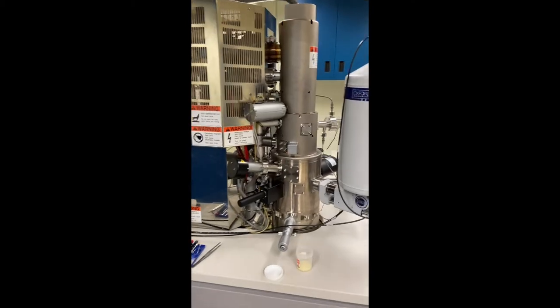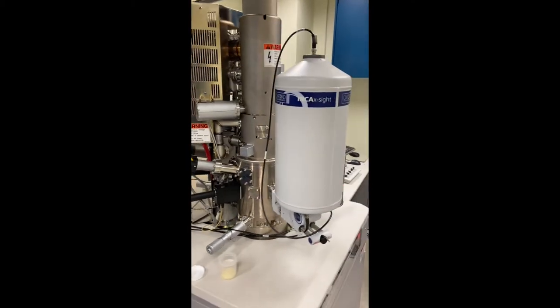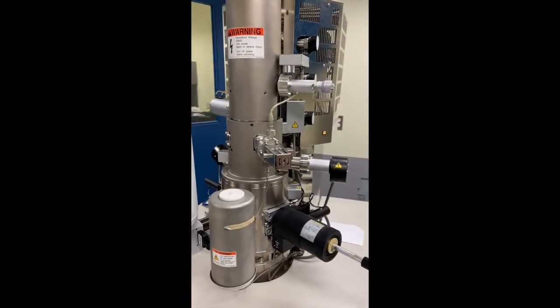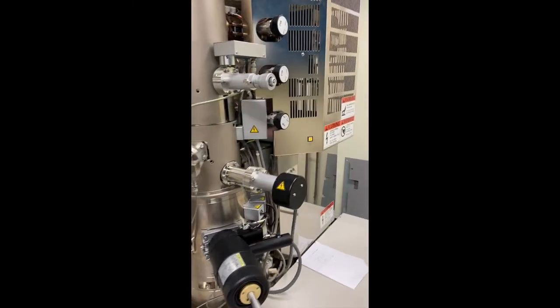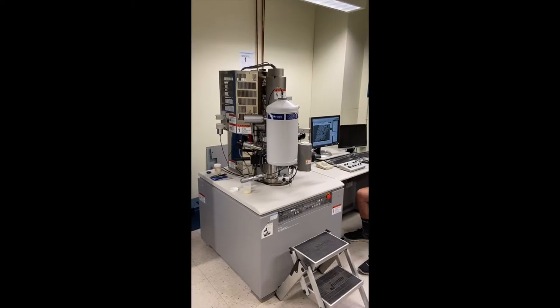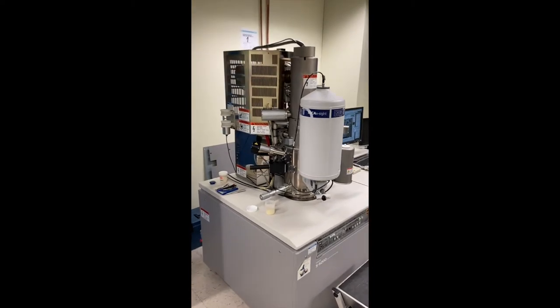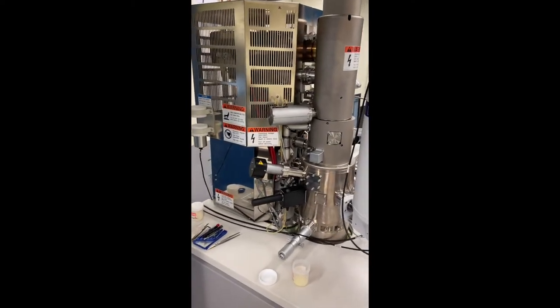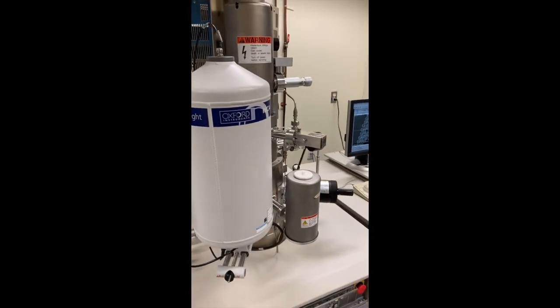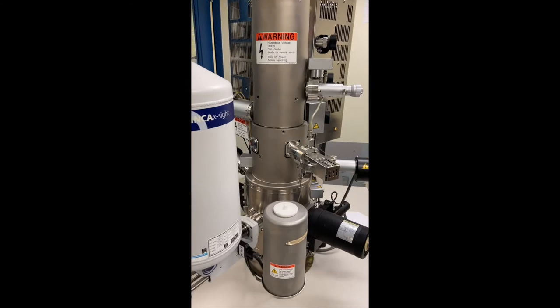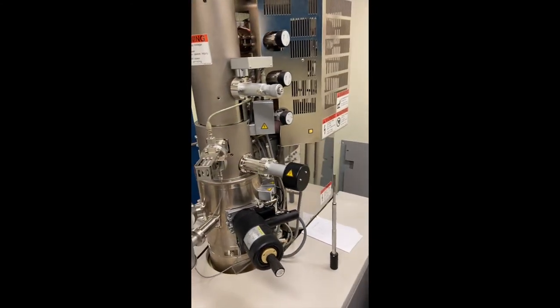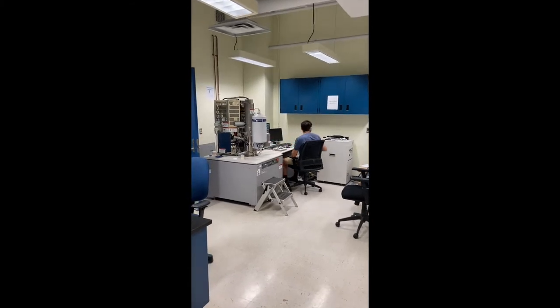While this setup is pretty simple, you can imagine that this instrumentation is not cheap and was not easy to make in the first place. That's because concentrating a beam of electrons and collecting a scattered signal and generating an image is more complicated than it would sound. The first issue that comes up is that you need a very high vacuum in order to keep the electron beam stable. As we discussed earlier, particles will scatter off of things that they are roughly the same size of. And since an electron is on the order of an angstrom or so, that puts it on the same scale as most atoms.